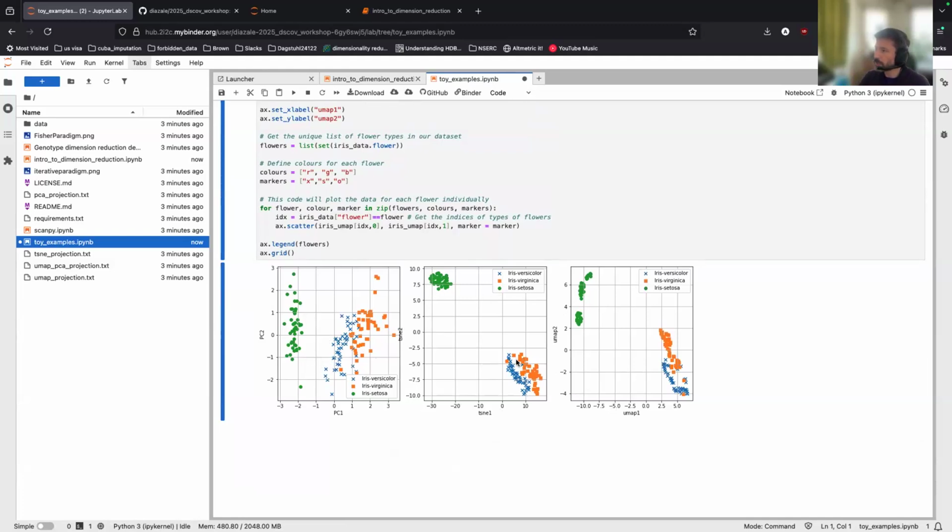it highlights one cluster here and then this one cluster with two subclusters. UMAP also brings up clusters as well, but you can see the sort of overly discretized clustering that comes up at times. So this is something to always keep in mind that it will bring up clusters, but the clusters could be artificial. So those are the toy examples that we have.